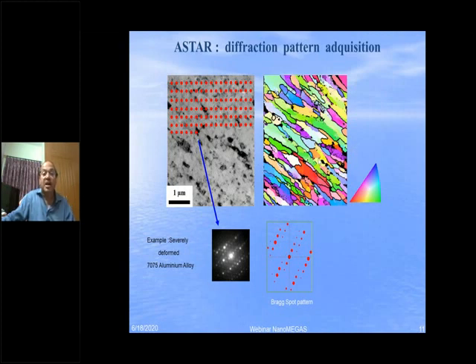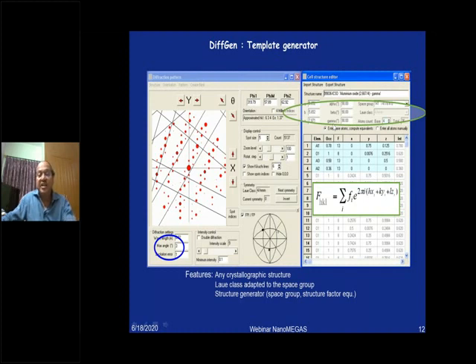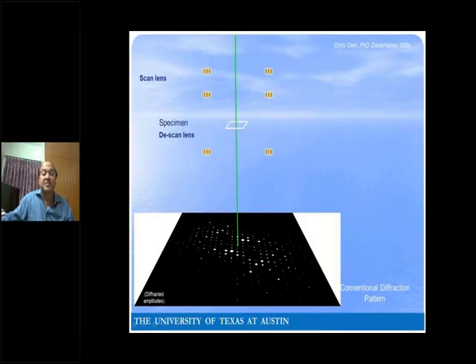So this is called diffraction, and this is what Partha has explained. This is how it is done, how the software takes care of it, and how it is automatically mapped. These are all taken care of. The main thing is that you have to put in a structure value. That means you put in the lattice parameters a, b, c and alpha, beta, gamma, what the structure is, and the structure factors are taken care of, which is then mapped subsequently.